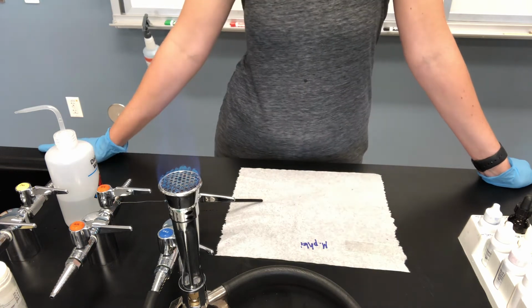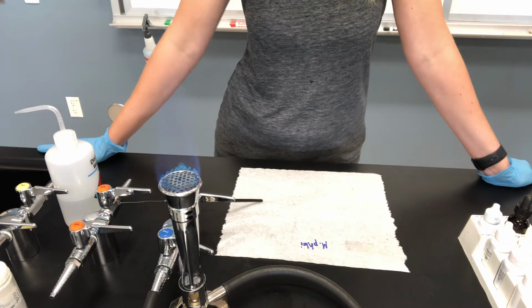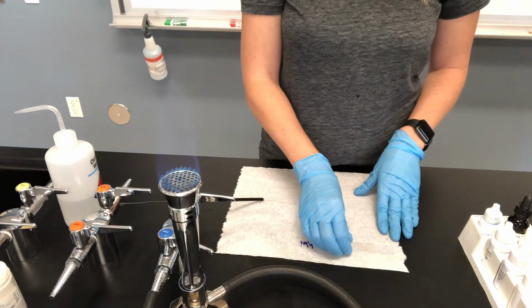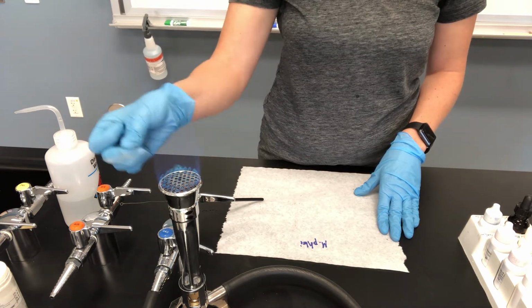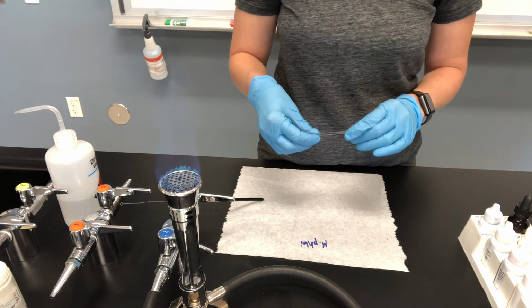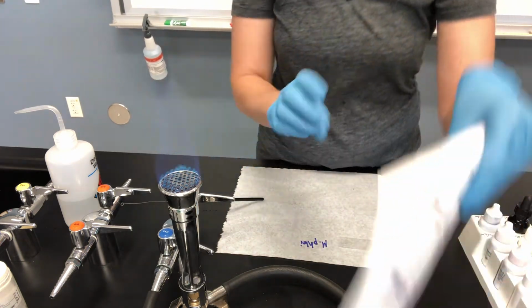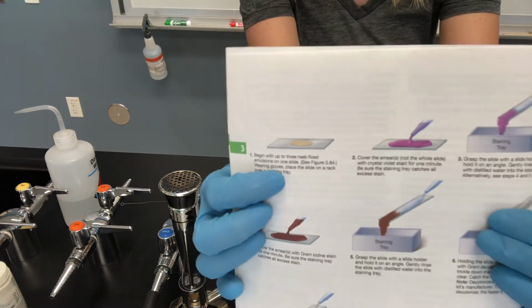But once you start the staining, make sure that your staining is done one slide at a time, just to prevent any mistakes that could happen. Okay, so this is air drying. Okay, I'll heat fix. Make sure we cook those bacteria, get them stuck on the slide. All right, so now we're going to start here. This is our heat fixed smear. I can turn my flame off since I've done heat fixing.